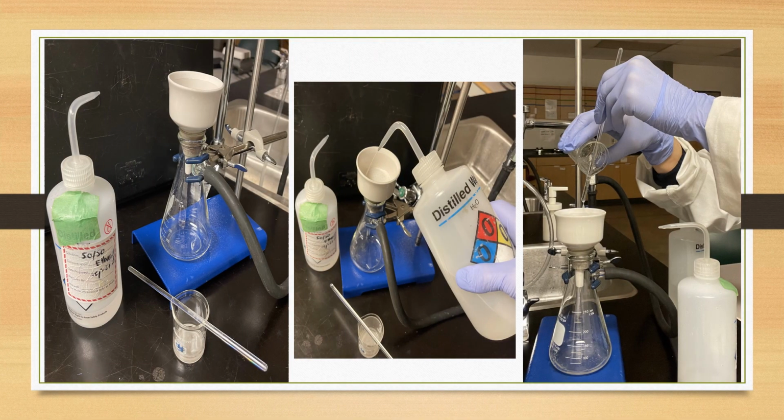Now open the whole blast of the tap water for a stronger suction and check the suction. With a few drops of water, the filter paper is wetted for a better sealing. Use a glass rod to direct the solution from the 50 ml beaker when pouring into the funnel.